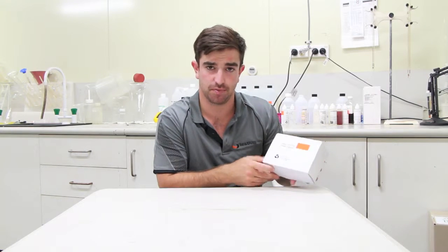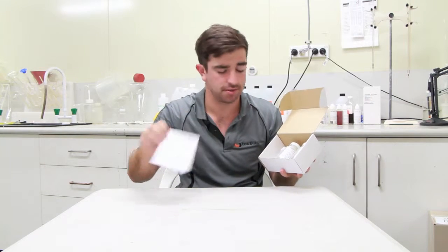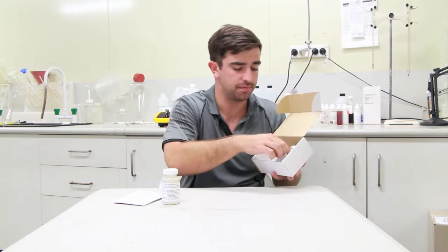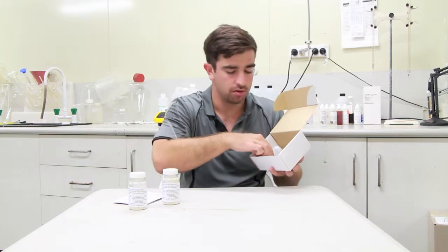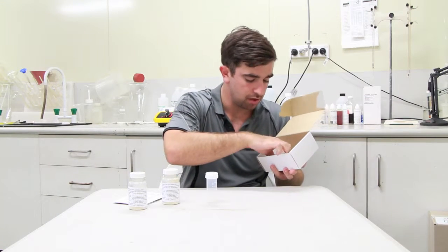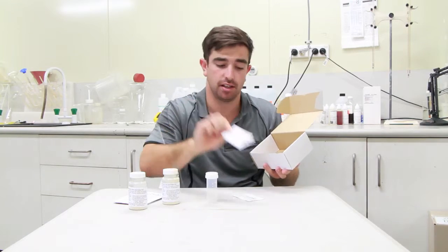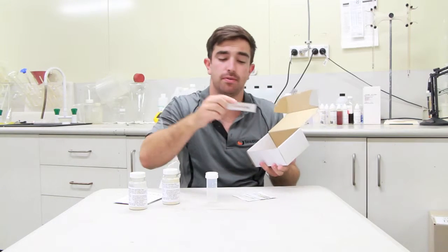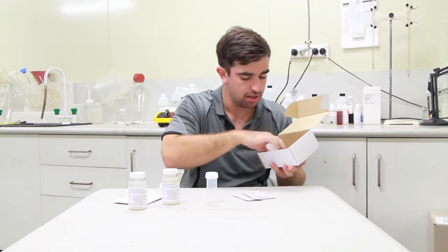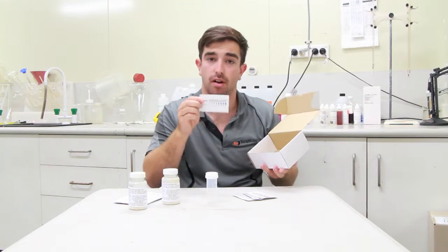These tests are quick and simple to do. Inside our test kit you'll find instructions for the tests, you'll find two bacteria tests, you'll find a test tube for your sample water, you'll find test strips for free chlorine, test strips for pH and alkalinity, test strips for total hardness, test strips for nitrite, test strips for copper and test strips for iron.